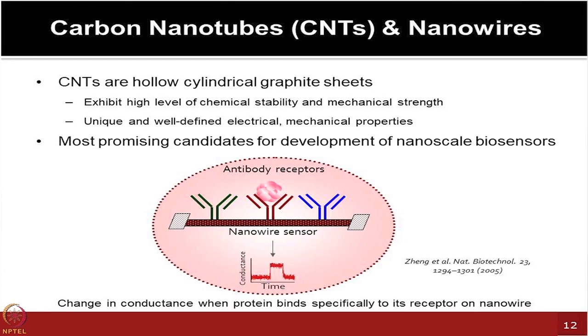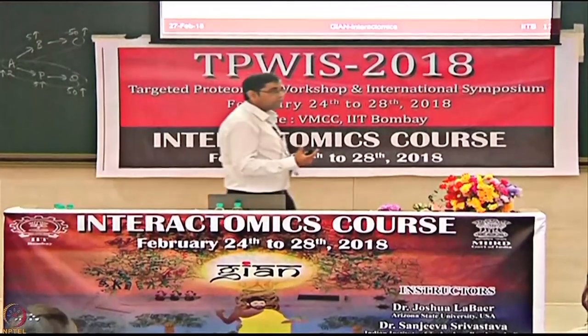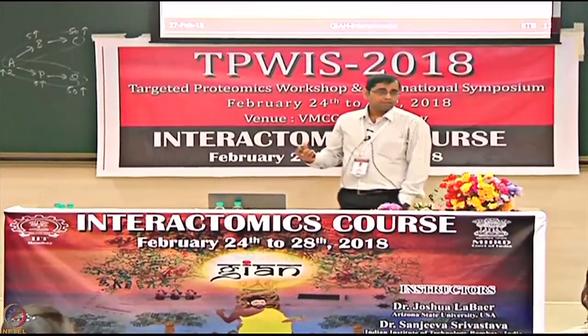One of them is showing you here, these nanowire sensors, on which antibodies are immobilized. If a protein binds specifically to this antibody, then you will see a change in the conductance happening, and this is recorded here over the time period. Simple technology, simple concept can have so much clinical utility.